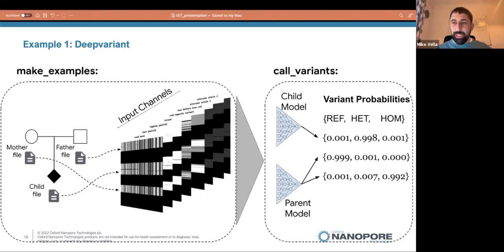And this is actually quite a challenging problem. A human genome contains around 3 billion base pairs, and when you sequence DNA, there's an error rate associated with that. So you can't just sequence DNA, have a look at one read, and decide based on that one read of DNA that this person has a specific variant. And also, let's bear in mind that you've got DNA from your mother and from your father also. So one read wouldn't be sufficient anyway.